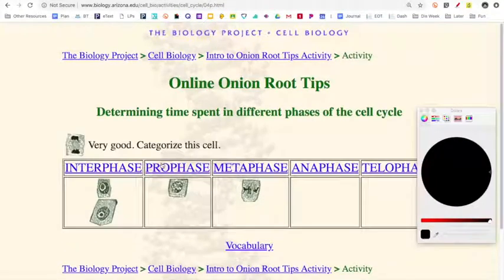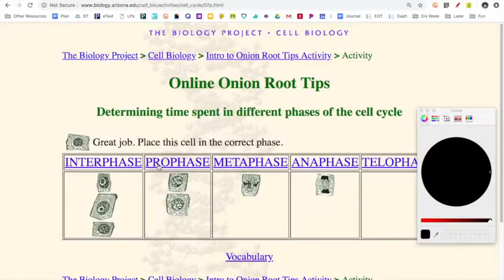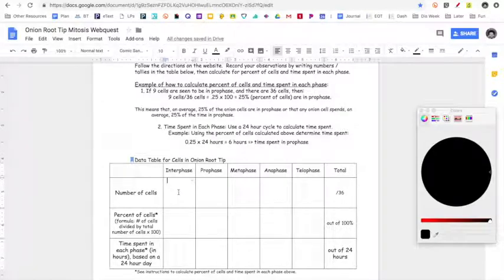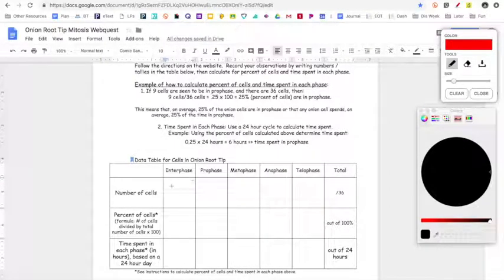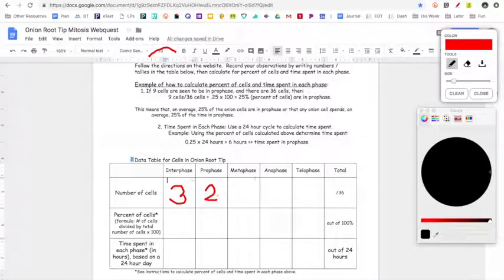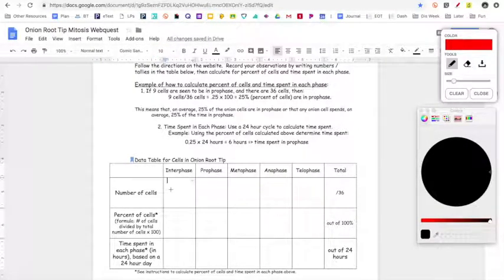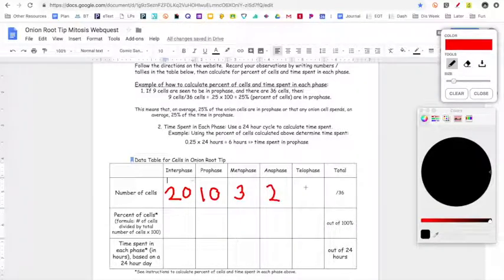You're going to keep on clicking through, organizing all these cells based on what you can see in the picture. Once you get to the end, it's asking you to count up how many cells you have in each column. For example, with what I've got here, I would count up three in interphase and put a three into that interphase box. I had two in prophase, one in metaphase, and one in anaphase. Had I kept going, I would have found enough cells to add up to 36 total. To show what that would look like: say you have 20 cells in interphase, 10 in prophase, three in metaphase, two in anaphase, and one in telophase.